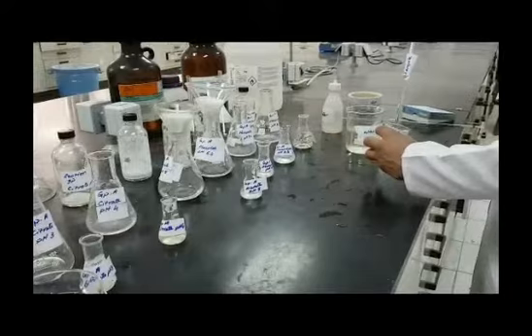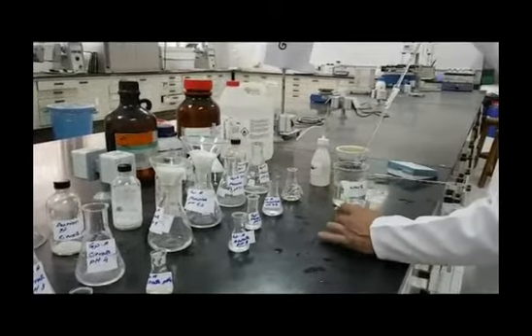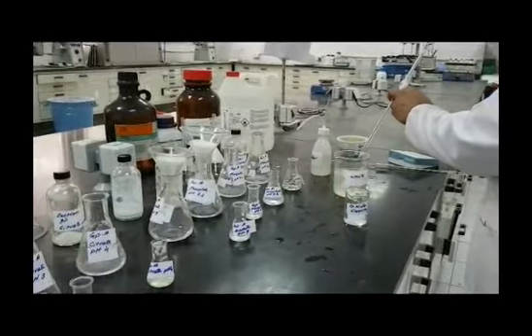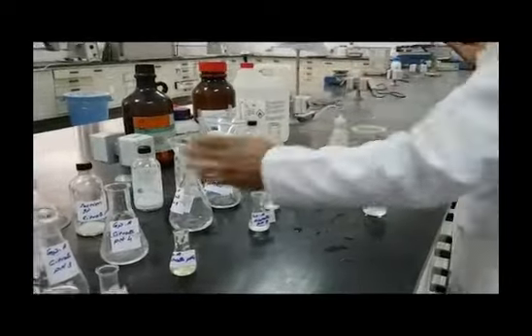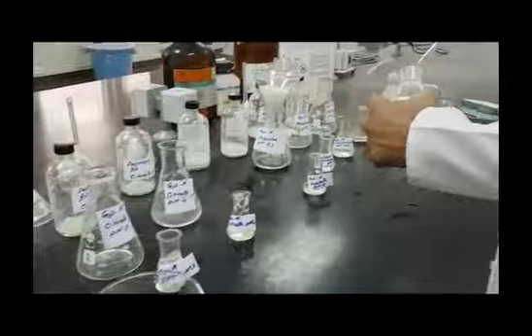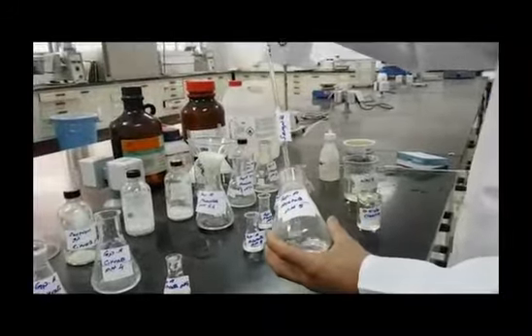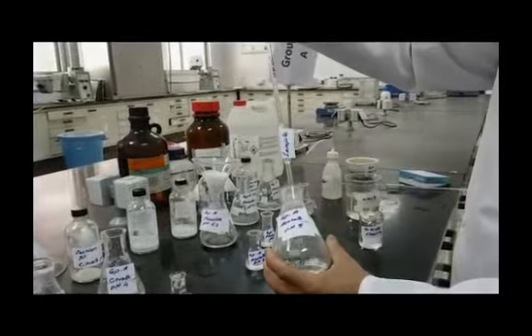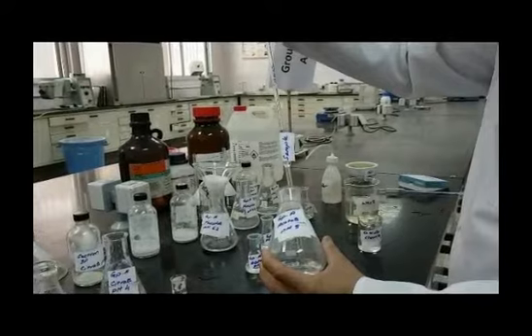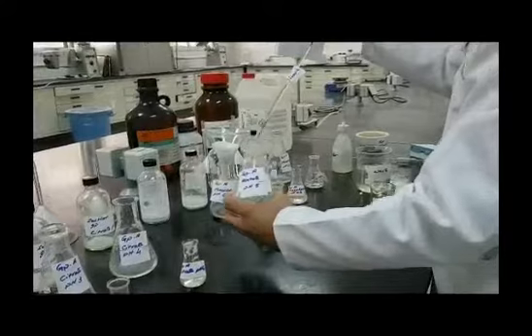Why this dilution step? Why do we need to dilute our samples? You know that we will analyze our samples using UV-visible spectrophotometric analysis, and this requires the use of a blank. By definition, a blank is everything in the sample but the substance of interest, in our case mefenamic acid.